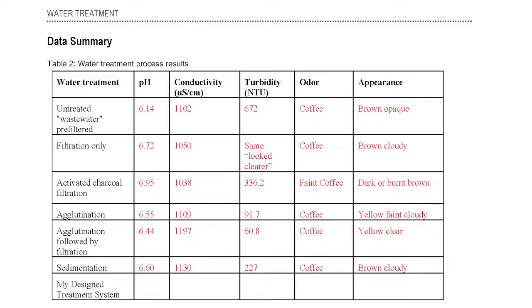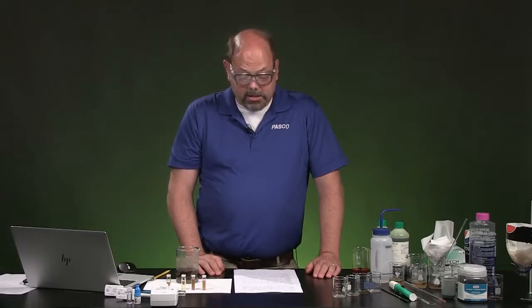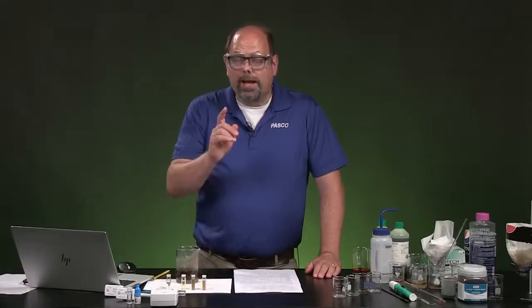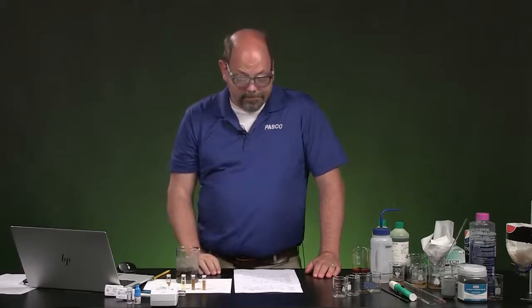We saw that wasn't the case in the pH, but there may be something that was a little salty, some kind of a treatment that is in there. It picked up a little saltiness, or that's just the variation that's in the sensor. It's only within 25 to 35 values of each other. But we didn't see much change. Why? Because these particles are dissolved. They're dissolved and they're not just suspended. So dissolved things make it through filters.